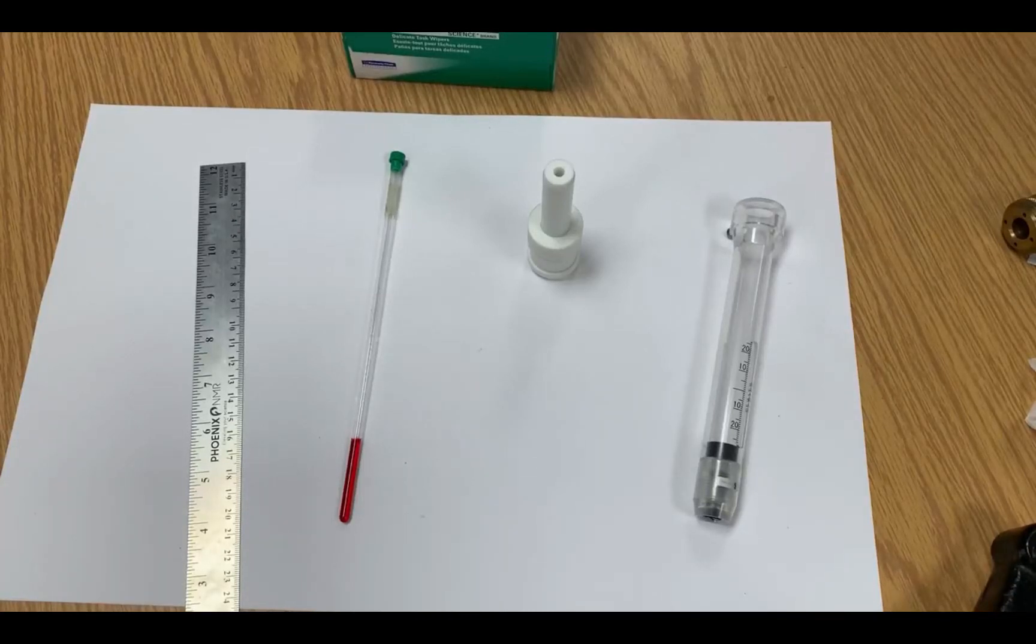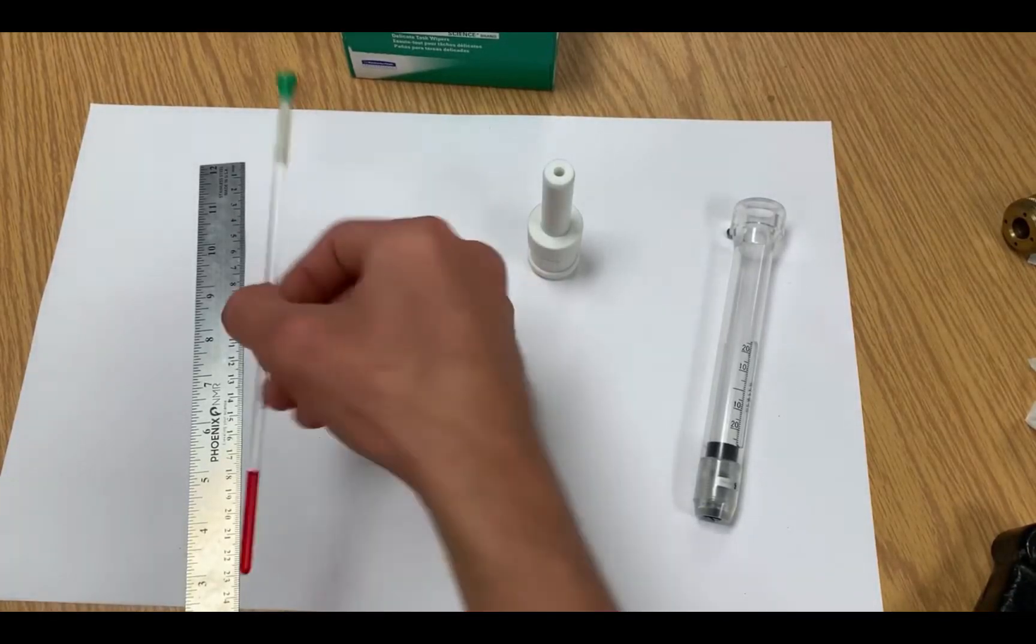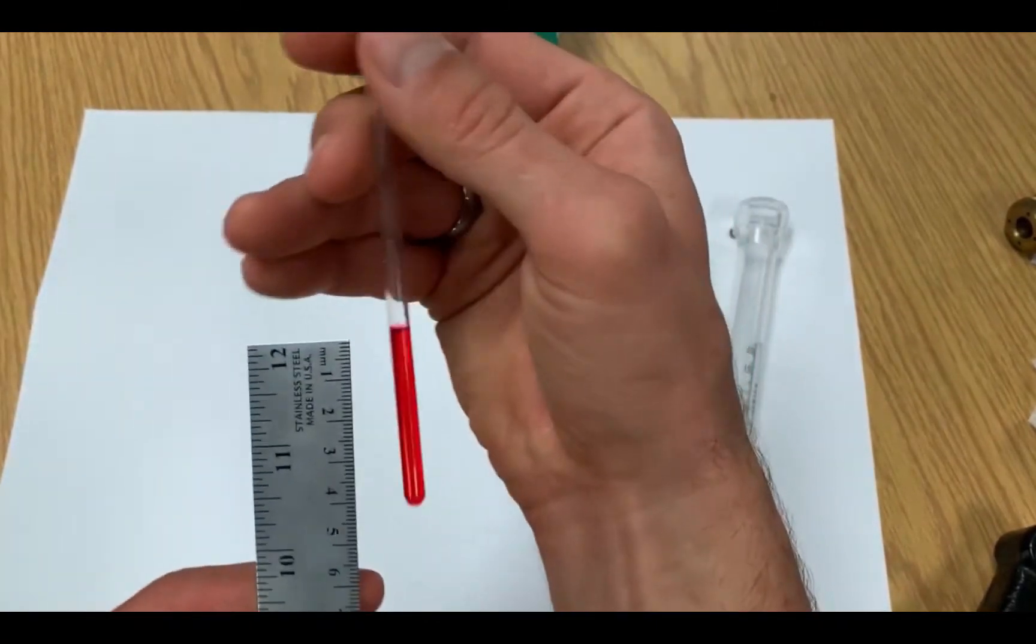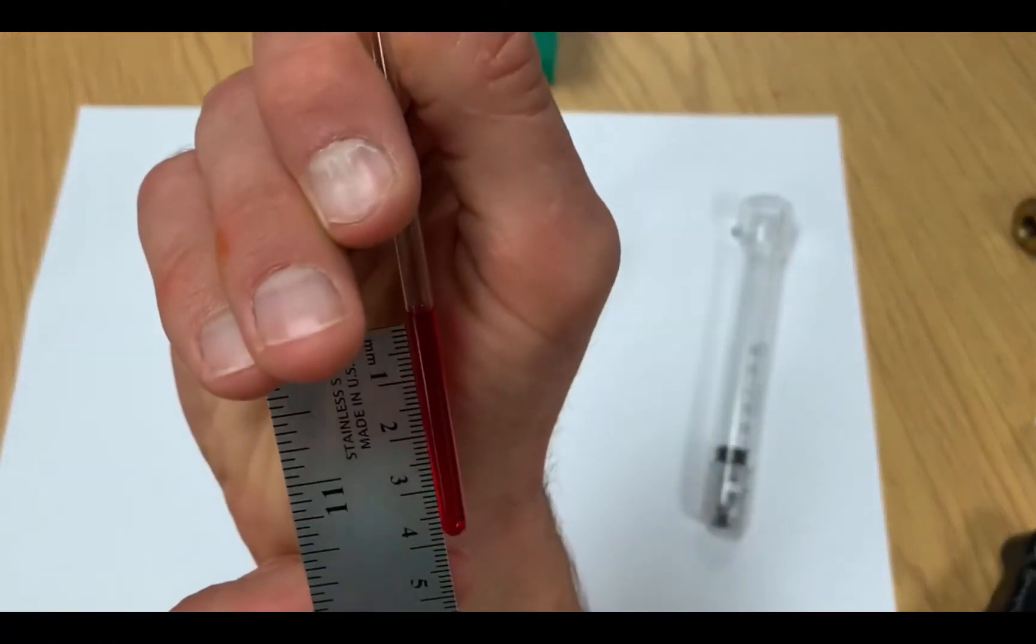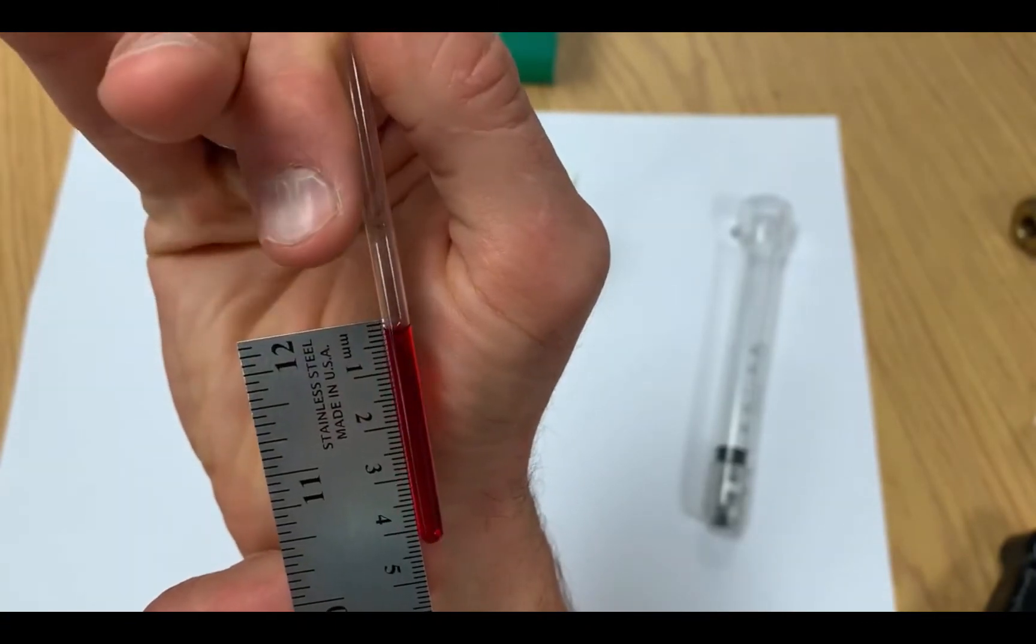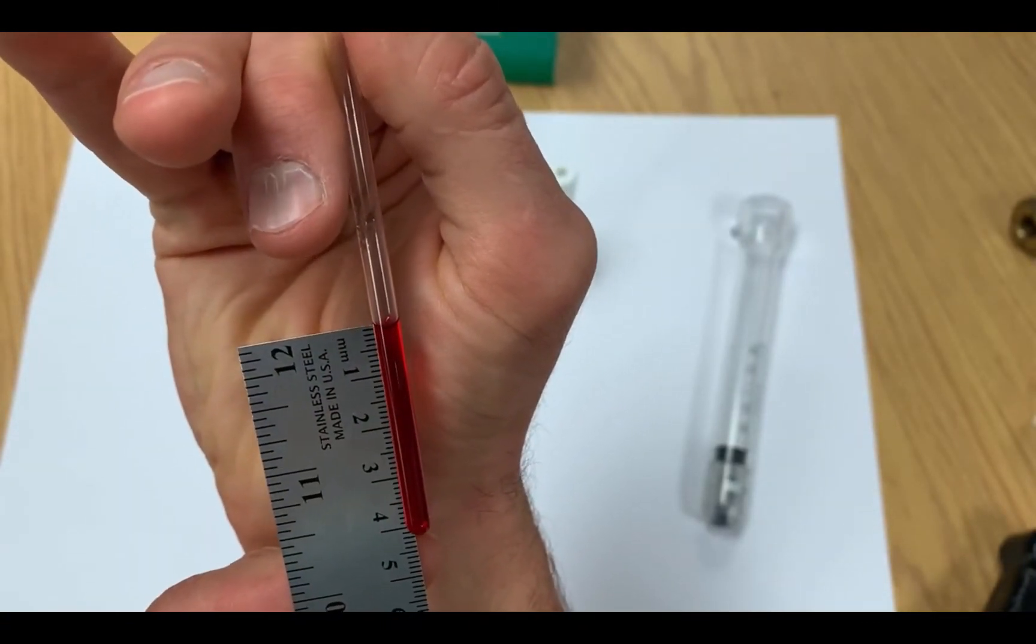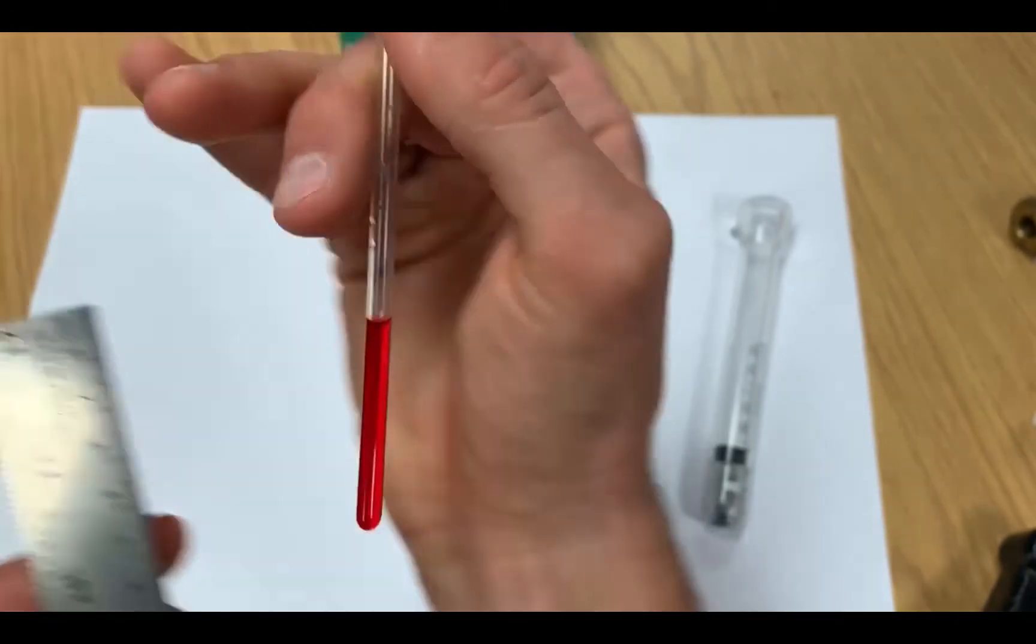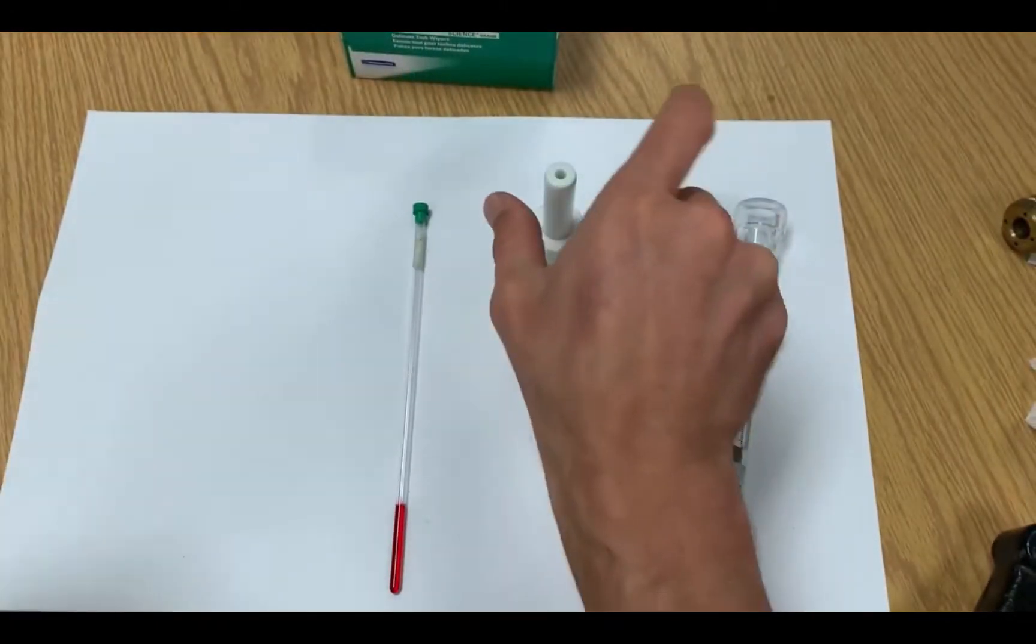Consistent sample preparation is critical in obtaining quality results. On most JUL systems, you want to aim for 4 centimeters of sample height. Note that you shouldn't rely on a volume, as the tolerances of inner diameter of NMR tubes can vary significantly with price of the tube.